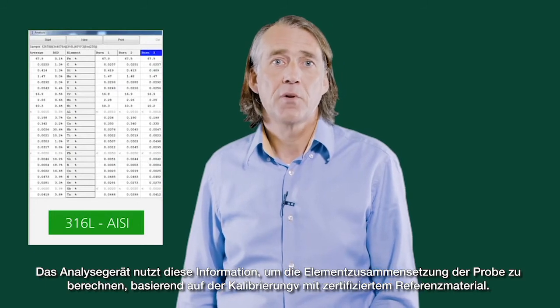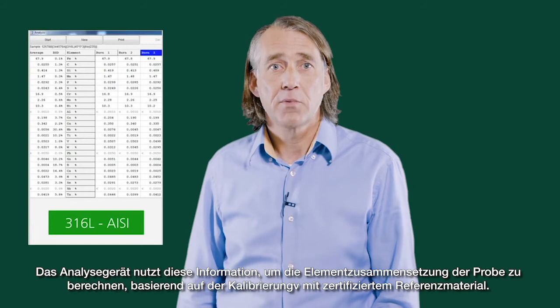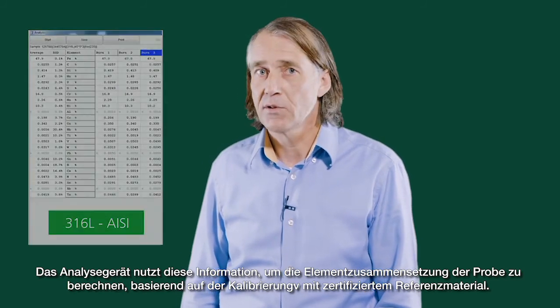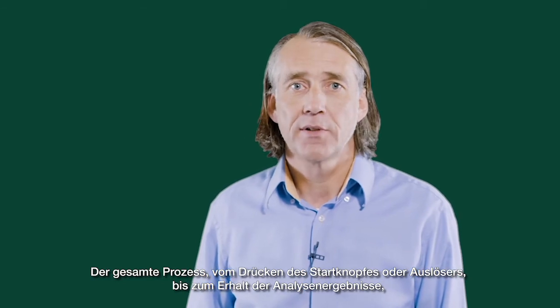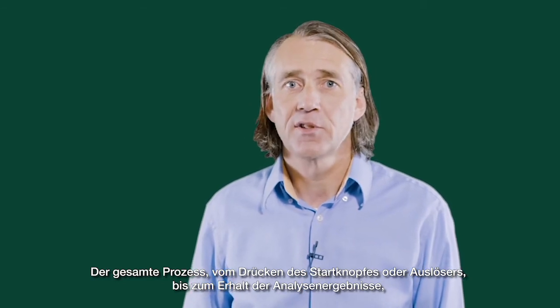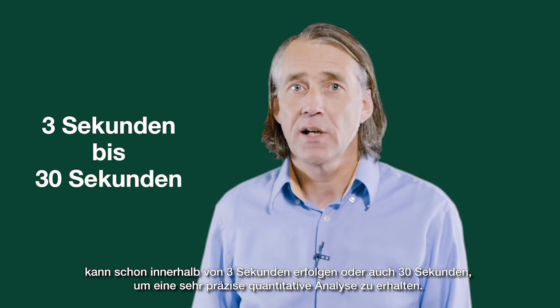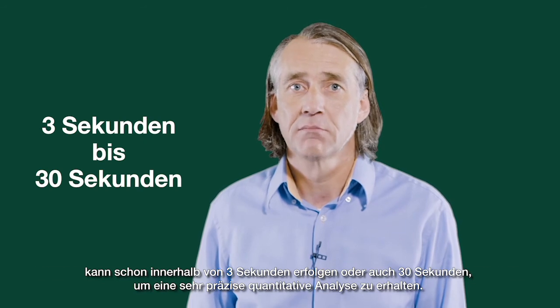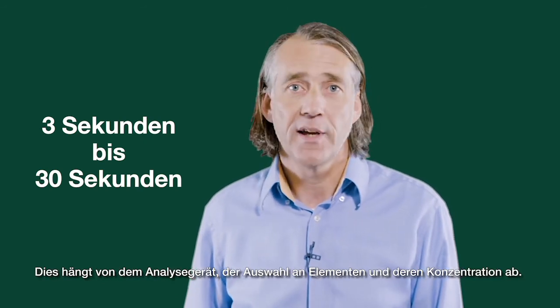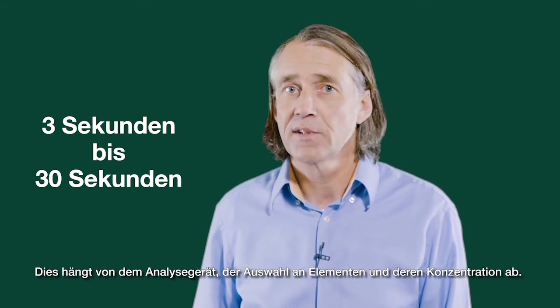The analyzer then uses this information to calculate the sample's elemental composition based on a calibration with certified reference material. The whole process from pressing a start button or a trigger to getting the analysis results can be as quick as 3 seconds, or it can take up to 30 seconds for a full, accurate quantitative analysis. It all depends on the analyzer used, the range of elements measured, and the concentrations of those elements.